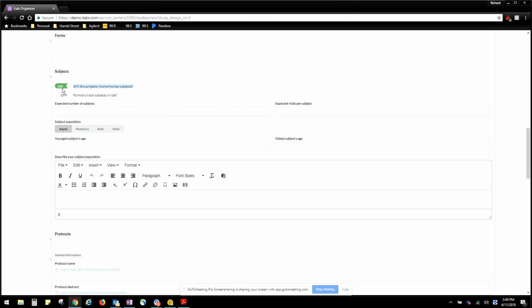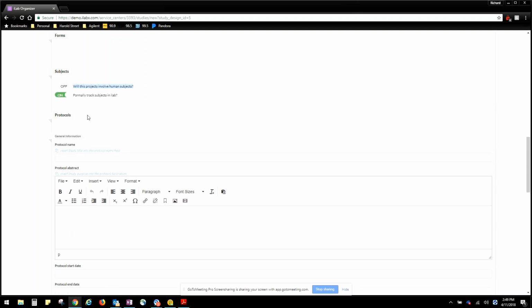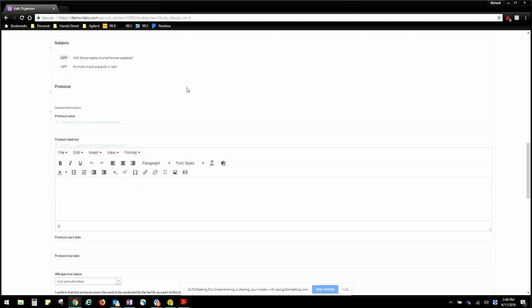But just do know there are ways that iLab is able to maneuver around PHI, but as a general rule of thumb, we don't usually like to house it. I think it's probably a shared interest, and we do that for compliance reasons and other reasons. But if it does seem like we will be messing around with PHI, we can go ahead and slot that conversation for another time.